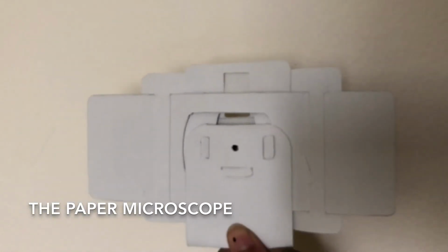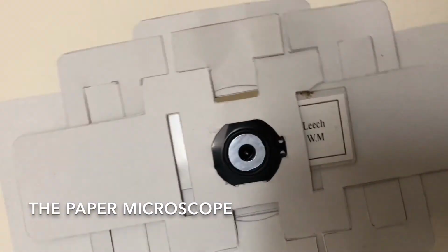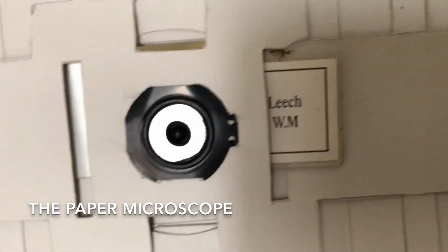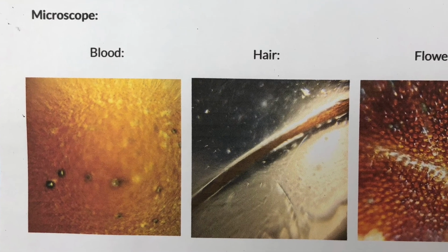We can also create our own slides with cardstock and clear tape. With the paper microscope, centrifuged blood samples can be turned into slides and observed under the microscope. These are the results for the paper microscope.